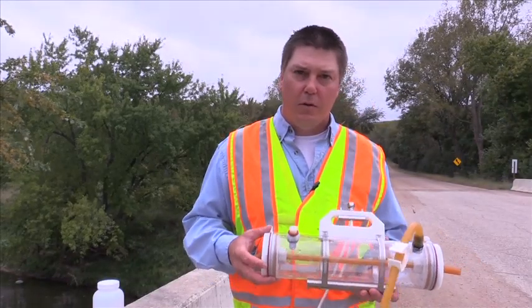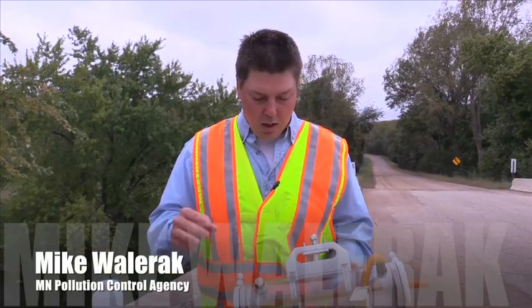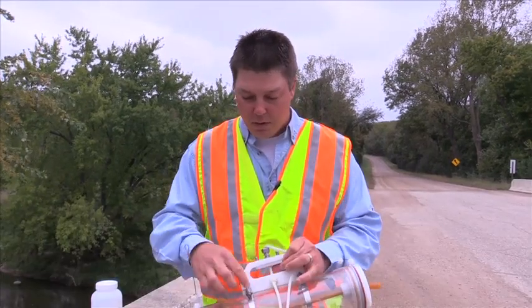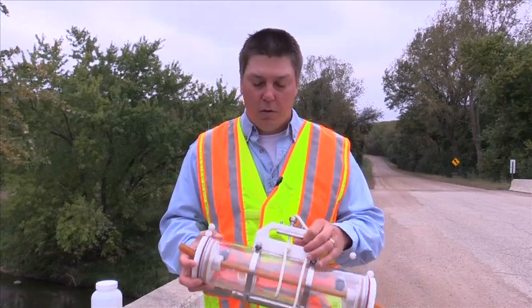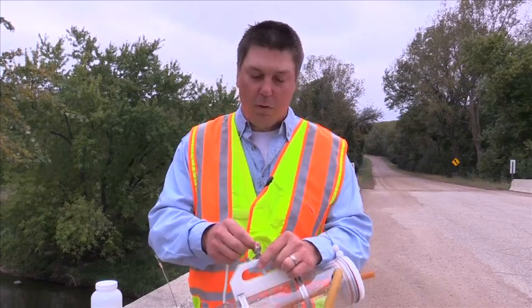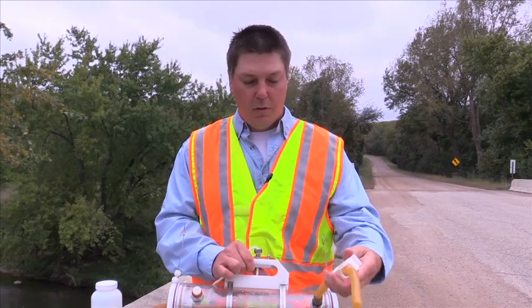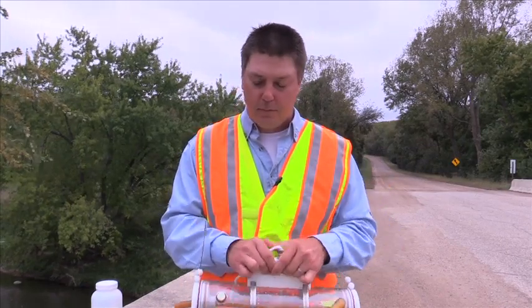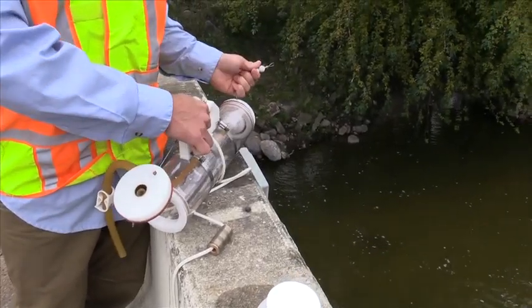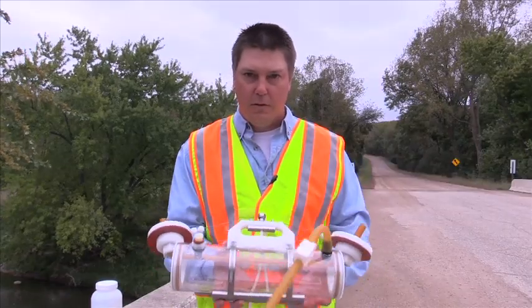When taking a water sample using the Van Dorn sampler, you want to be sure that the sampler itself is in good working order. Make sure the hose clamps are tight so they can't jiggle loose while you're taking the sample. Also make sure the rope where it goes into the spring mechanism isn't frayed, and that your sample is clamped. Then open up the trap doors on the side — now your sampler is ready.